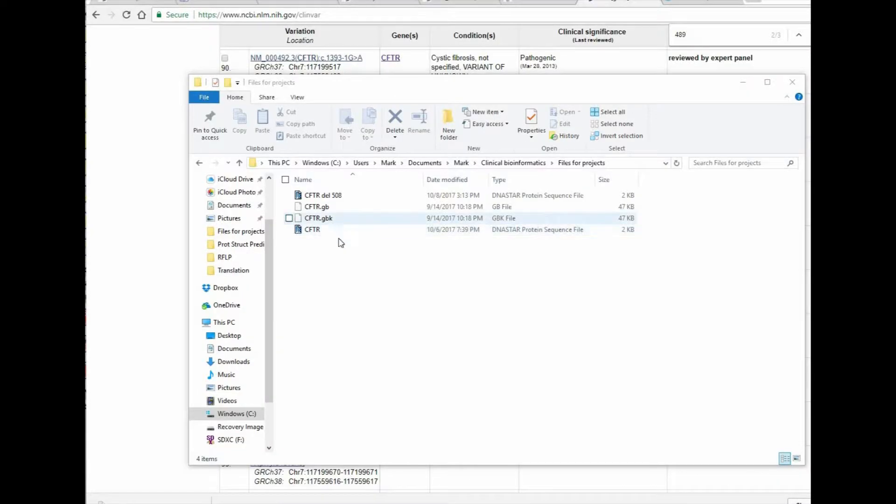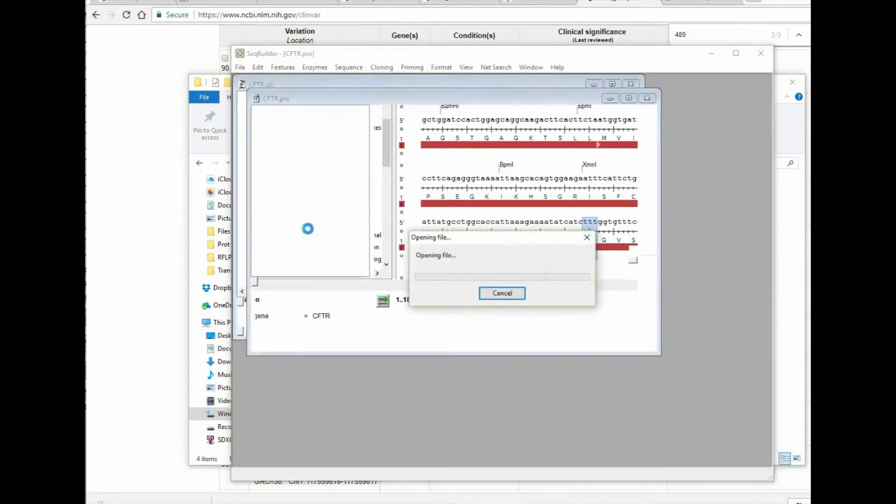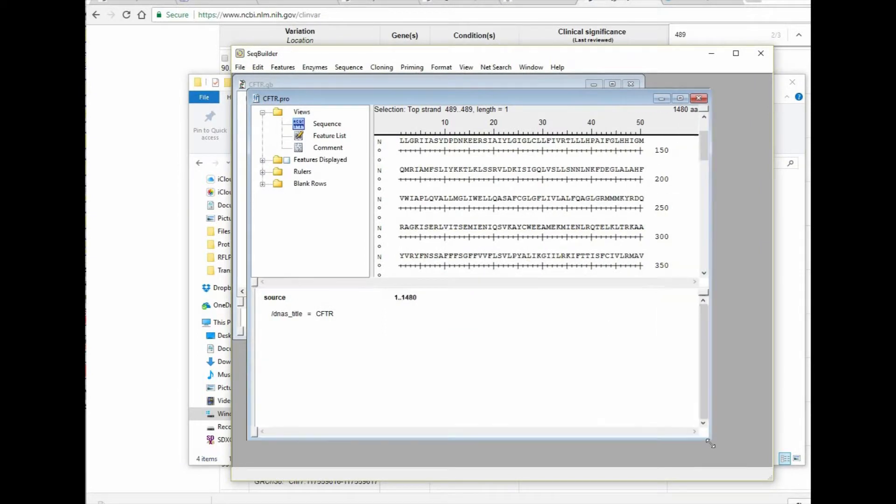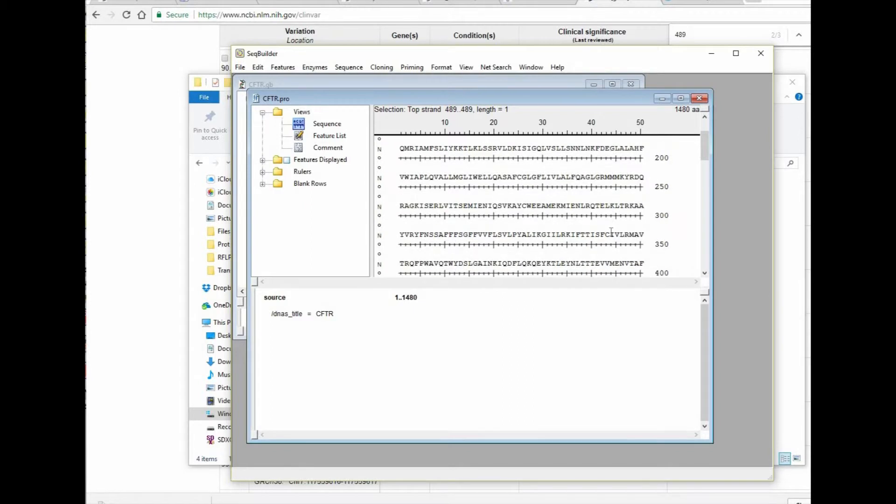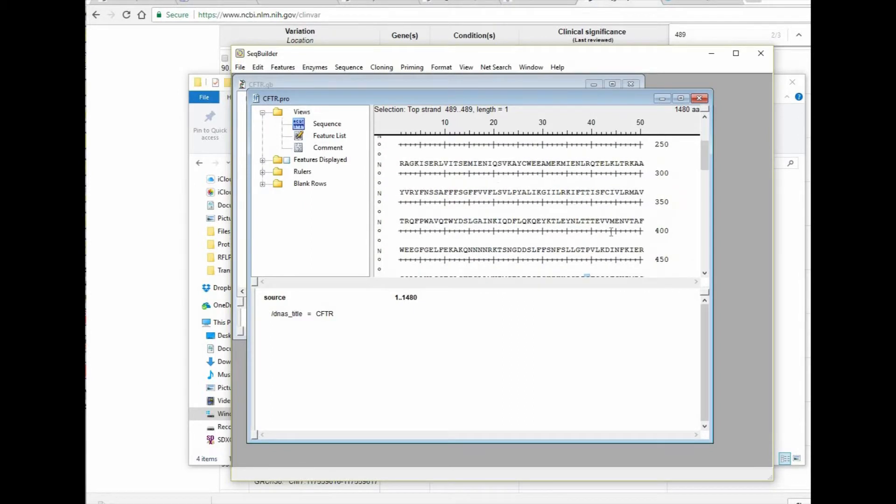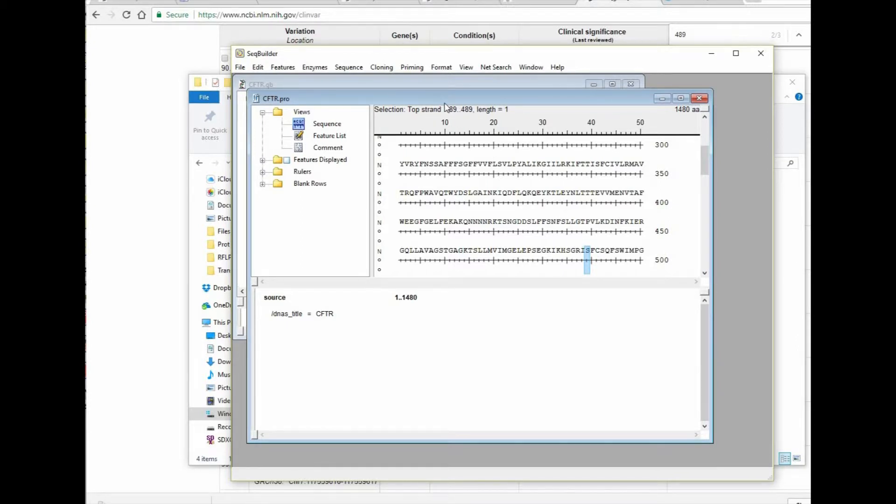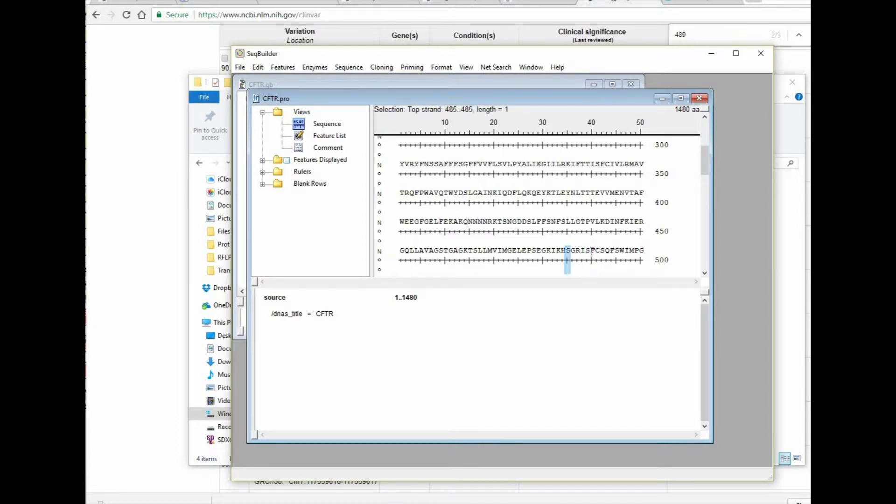So let's go back to the protein sequence and make sure that we know the neighborhood of amino acids within this. So we'll open up the protein sequence in SeqBuilder. We'll go to position 489 and make sure that we're at the right position. And then we'll look to make sure we also know some of the neighboring amino acids. So this is in a region that spells GRIS, and that'll be helpful as we try to find the correlating DNA sequence.